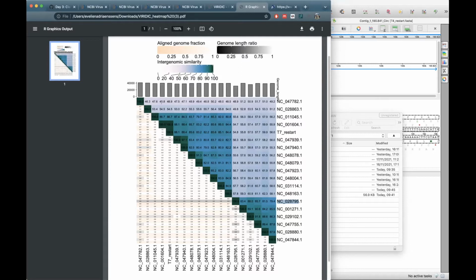So this is where in the realm of these, if we go below 70 and definitely below 50% intergenomic similarity, that's where we need to look at the protein level. And if you want to kind of redefine the whole lot, you can do that, but not just at the genomic similarity level. Is everybody with me when it comes to interpreting a plot like this? Okay, I can see 2 thumbs up. I'm gonna take this as a go ahead.